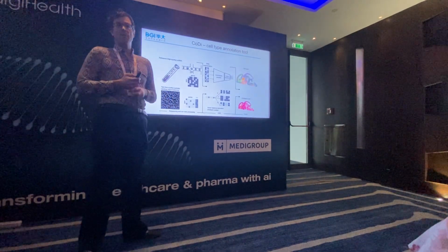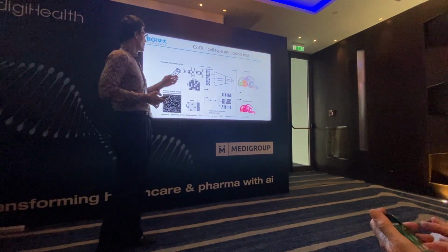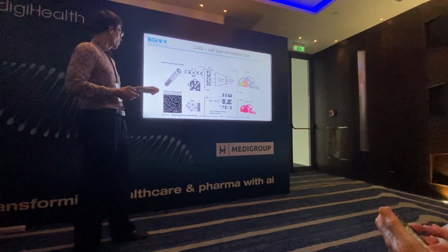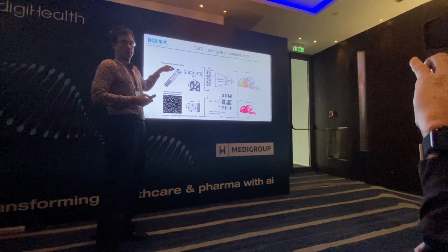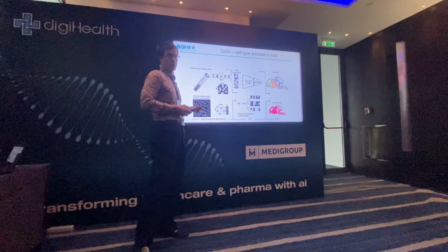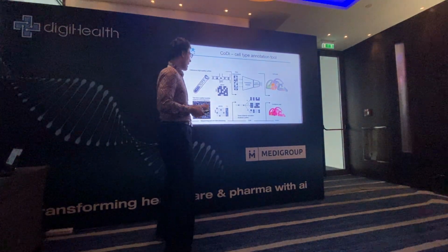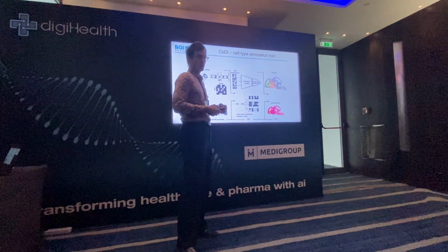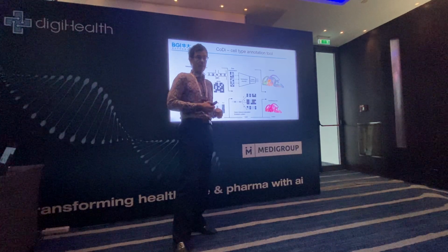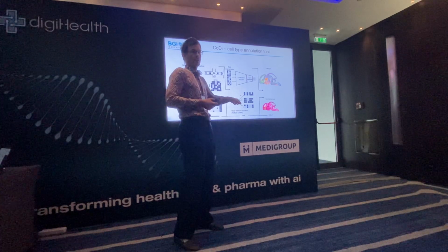Using this principle, we have developed CODI, the acronym is for contrastive distance, a tool for cell type annotation, which receives as its inputs the reference single cell dataset with cell type annotations and the spatial transcriptomics dataset, the test dataset that we want to annotate. And we perform two different tasks in parallel. The first one uses statistical vector distances in order to find the closest match from the single cell reference.